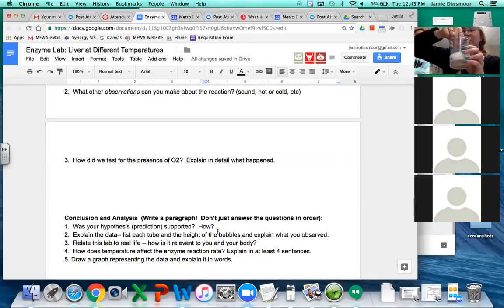Trying to find a nice oxygen spot without putting it out. No, put it out. All right, it worked though. It worked. We're gonna do it again. Evidence. Evidence. You guys saw, right? It went boop, and it lit back on fire.